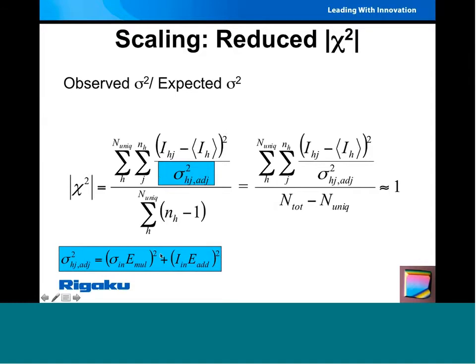If you look at this in the blue highlight here, this is an adjusted sigma, and when we were adjusting the error model, we were taking the sigmas from integration and, for example, adding a 2.6% error to the intensity in quadrature by squaring that, and also multiplying the sigmas that came from Denso by another scale factor to try to make that plot flat, to have the reduced chi-squared close to 1. This number ends up here underneath this.